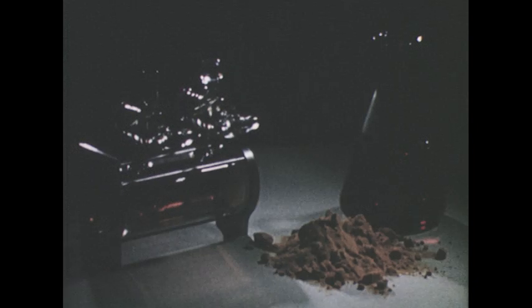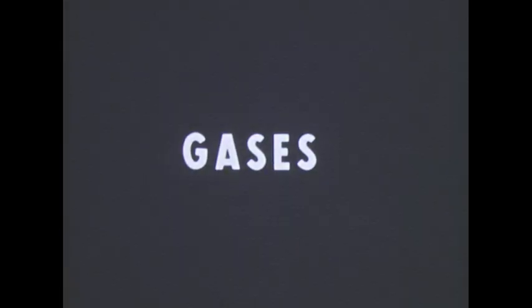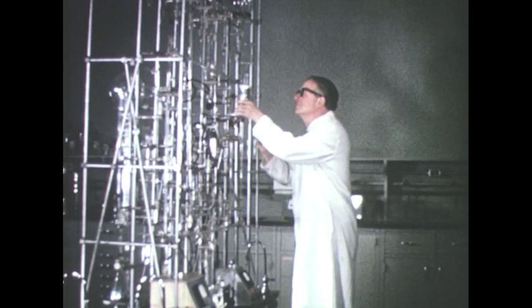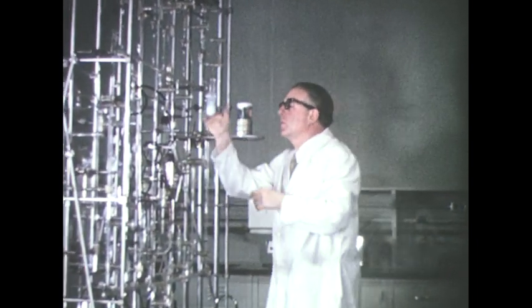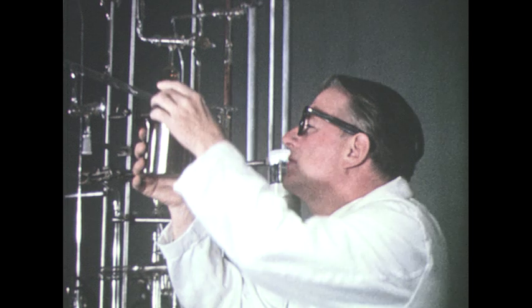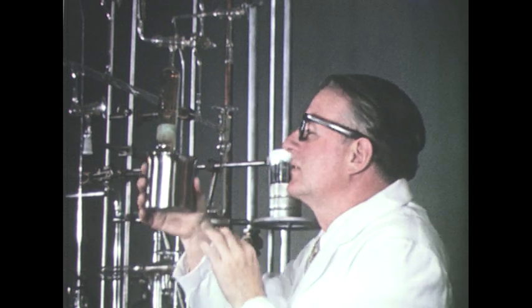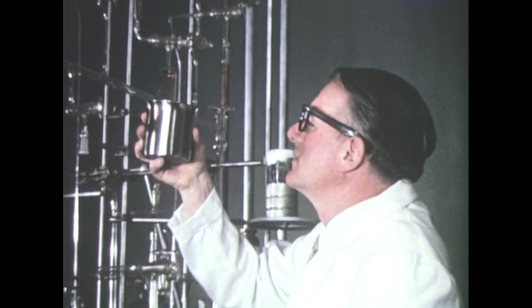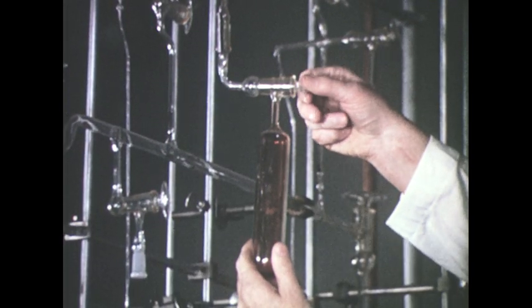Gases, liquids, and solids can all be readily studied by means of their infrared spectra. Gas samples, which have been condensed as liquids or solids by a suitable freezing mixture such as liquid nitrogen, are allowed to warm to room temperature. On warming, the solid changes to a gas. The gas is then transferred from the vacuum rack into an evacuated gas cell.